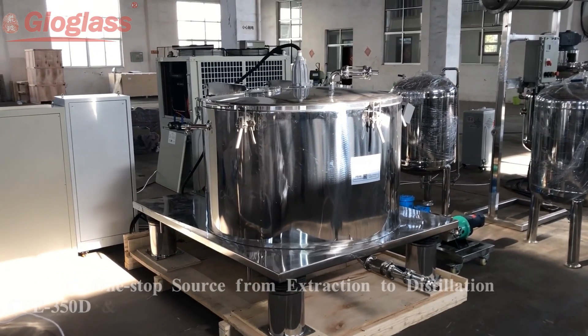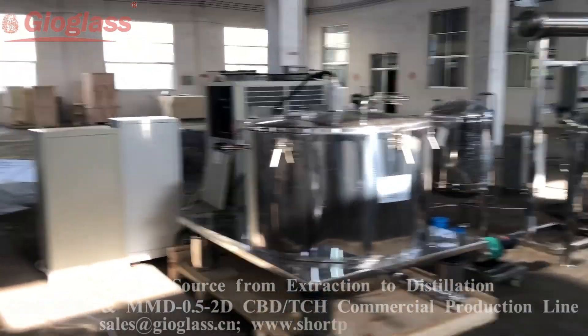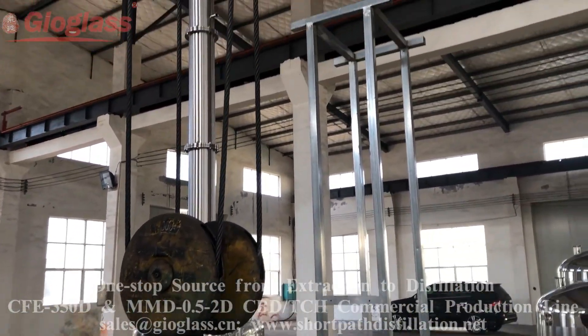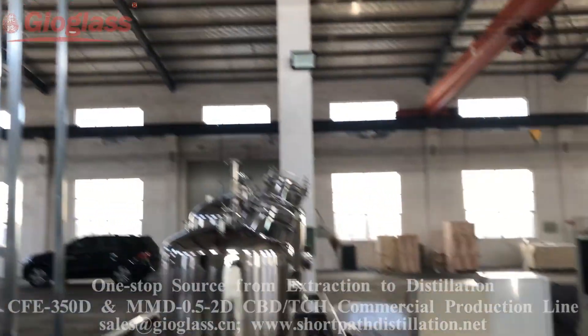Hello everyone, this is the CBD THC production scale production line.